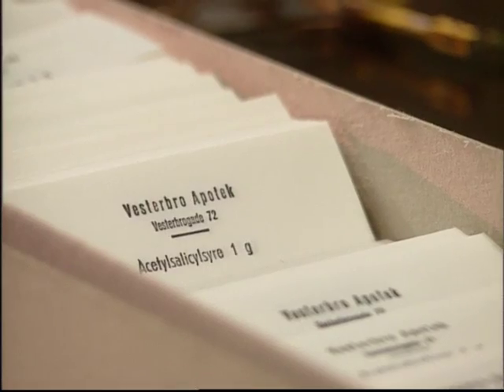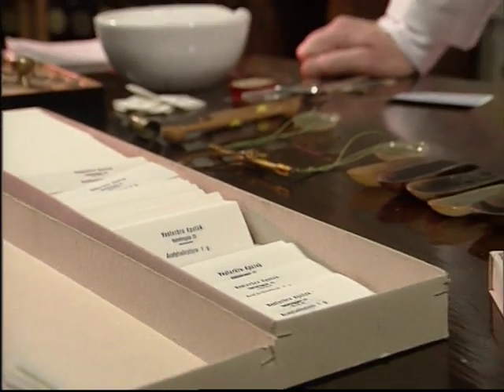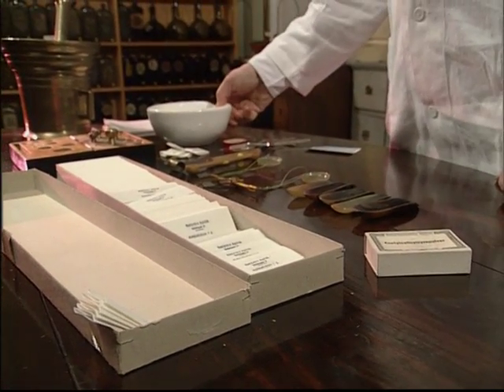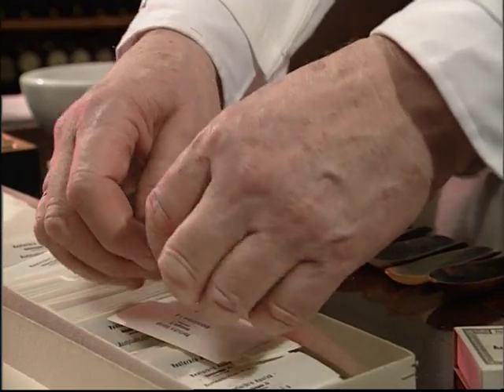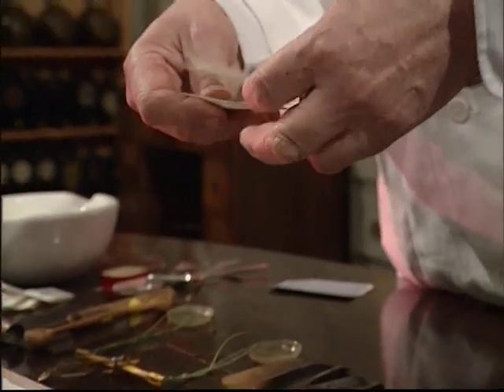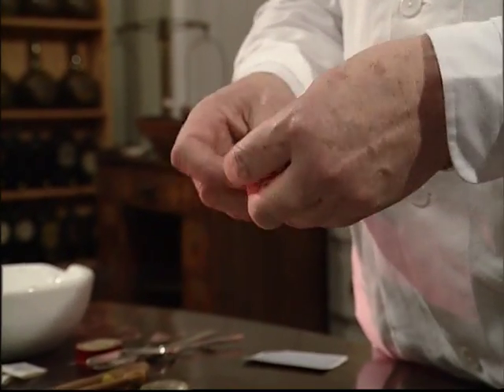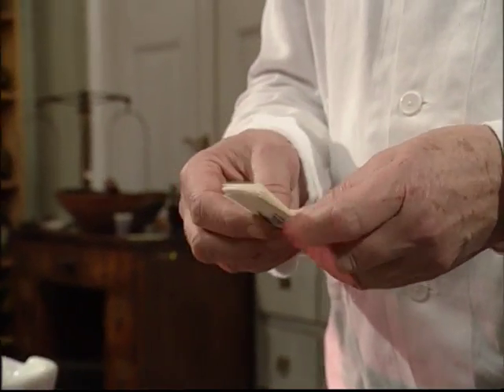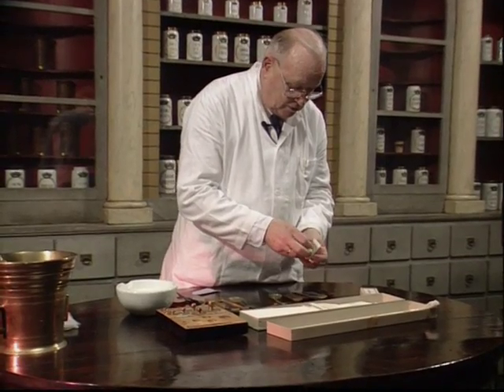A third example of a dosage form of medicine is dispensing powders. And it's mainly for headache. In this case, it's acetyl salicylic acid we have here. And we start by opening up the powder papers. We'll take 5 at a time and pinch them here and open.